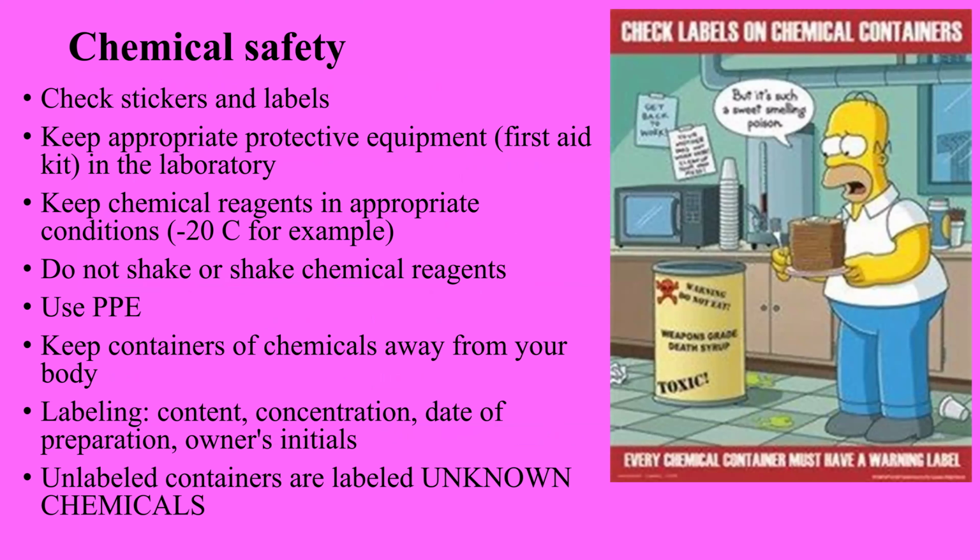Well, in the lab it's normal to label chemicals. In case we have something unlabeled, we label these unknown chemicals. Later, with colleagues, you can make some detective investigation of what this is. It's not easy to identify these chemicals. These chemicals should be disposed of.